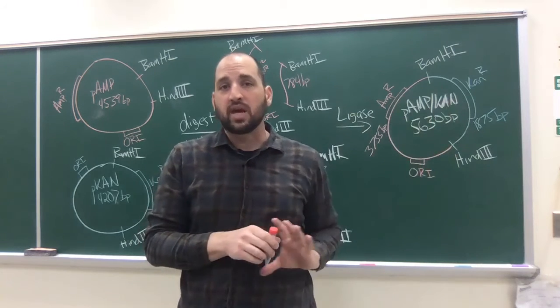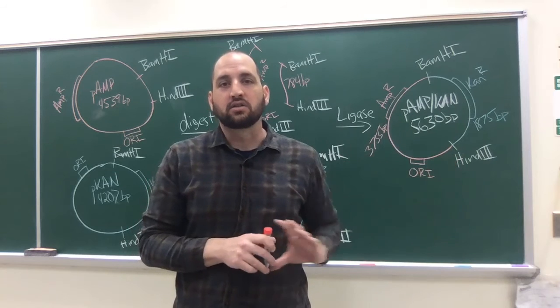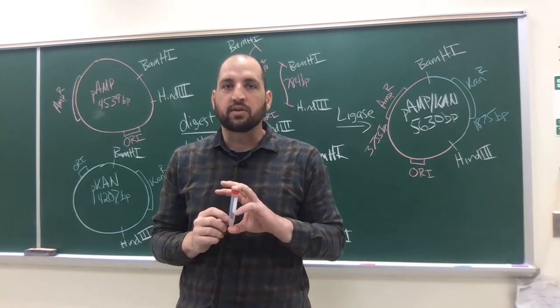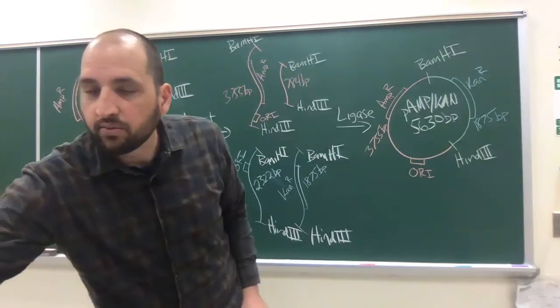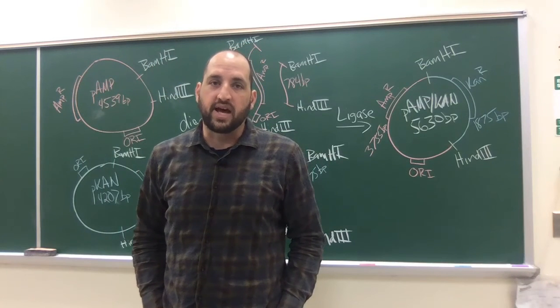We're going to incubate them for a short period of time, and then put them back in the clinical centrifuge to spin them down and collect them again. This time, we're going to resuspend with cold calcium chloride, but in a smaller volume. The whole idea here is that the calcium chloride is making those cells competent to accept the plasmid.